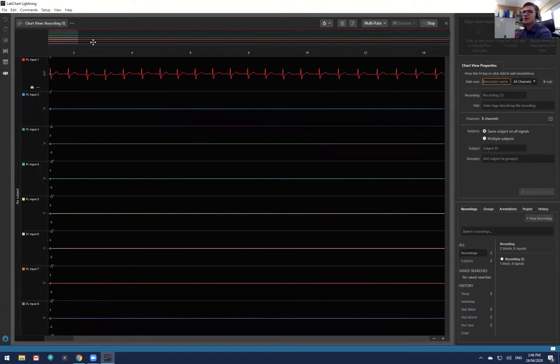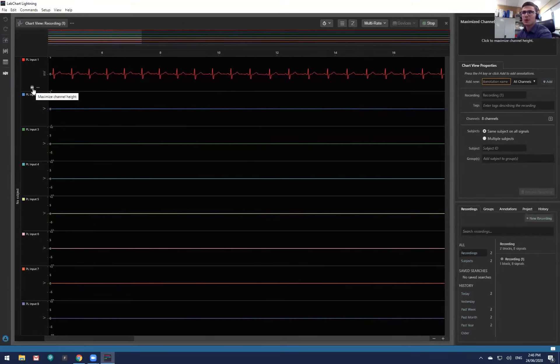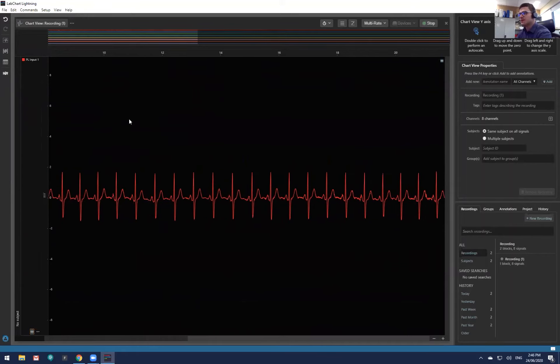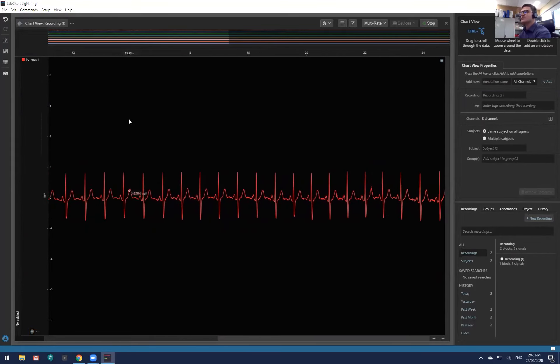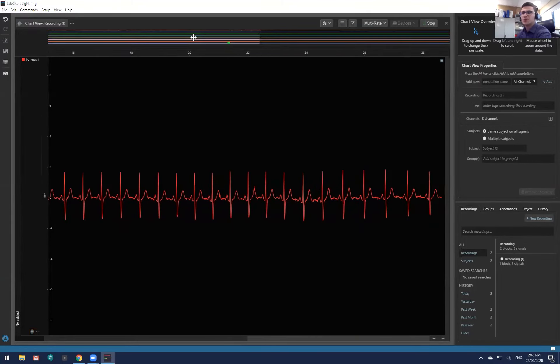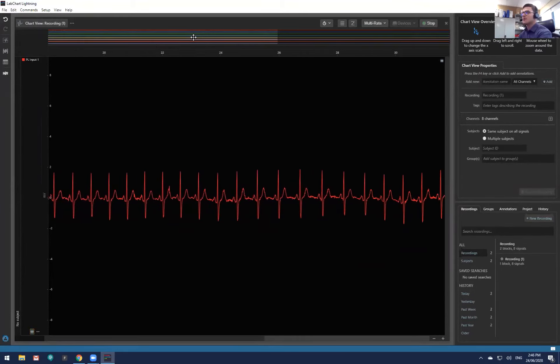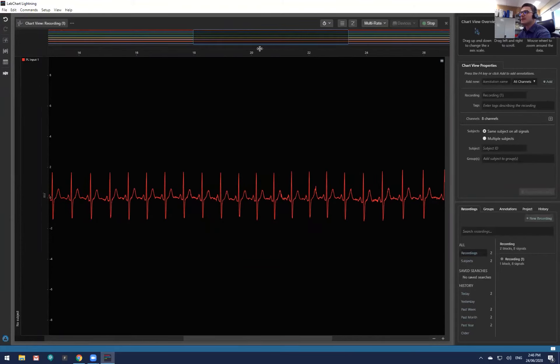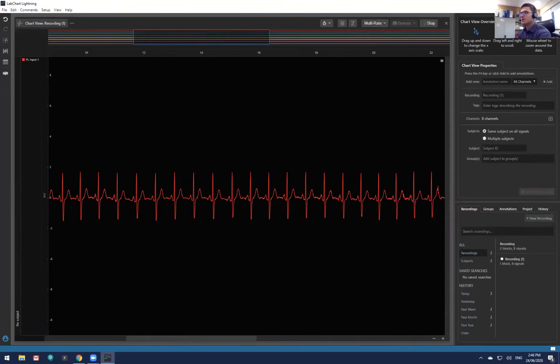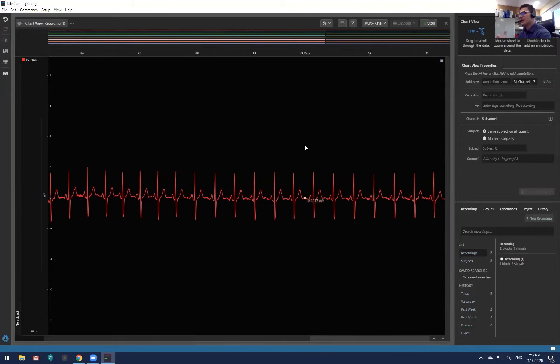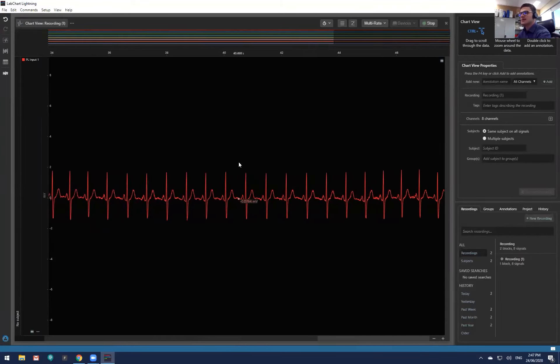I'm going to press the maximize option so you can clearly see my signal — that's a good ECG signal. At the top you'll notice a colorful display — that's my overview, showing what I have at the moment. Anywhere I click on the overview it will take me to that point in the recording. To go back to the live feed, I click on the right end of the overview.